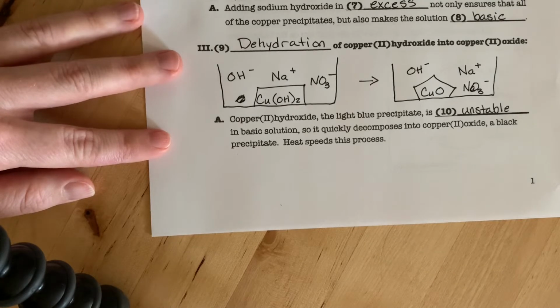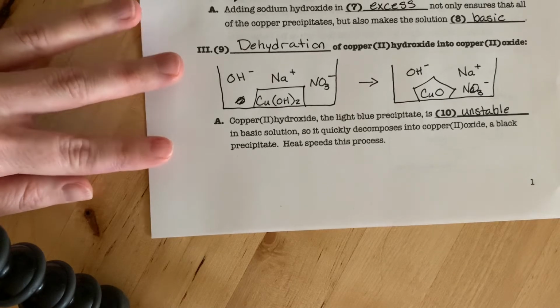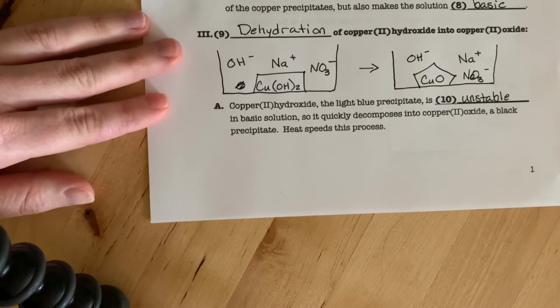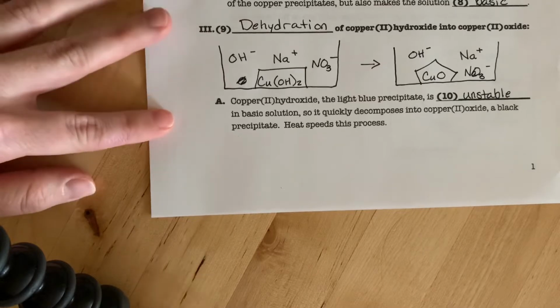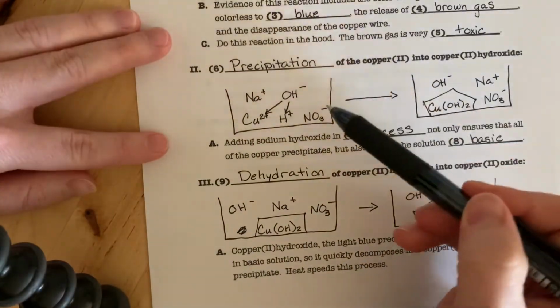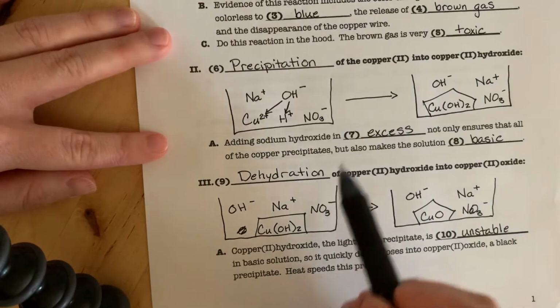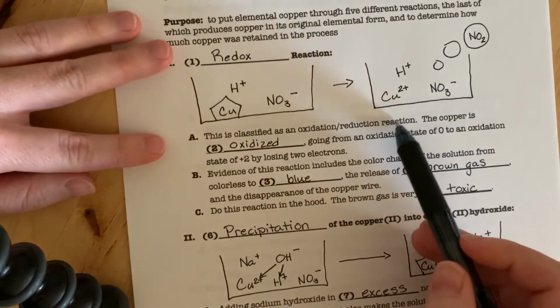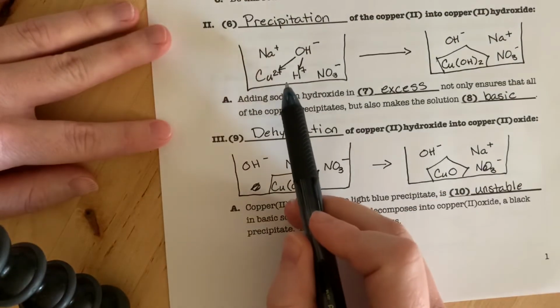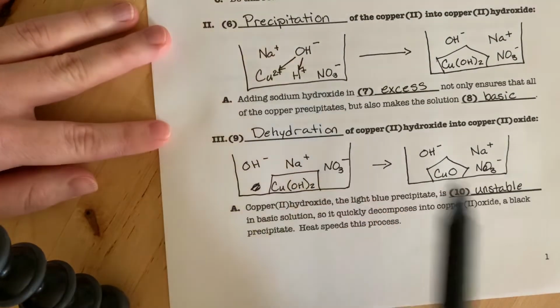Do a before and after picture, but figure out what the ions in solution are yourself. Look at the balanced equations in your lab manual. That will help you, and just follow the same technique that we've been doing. Our after picture from the previous reaction determines our before picture for the next reaction.